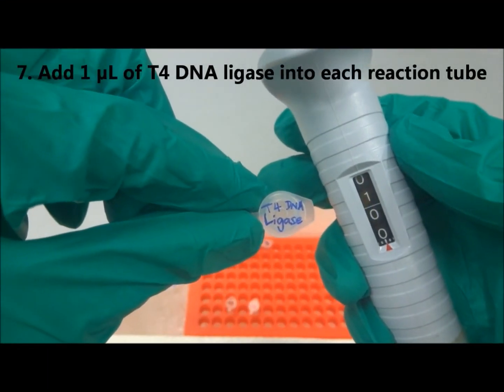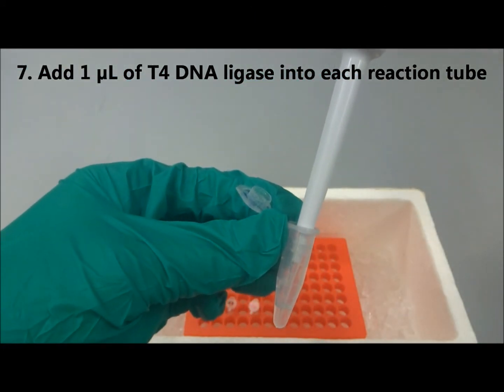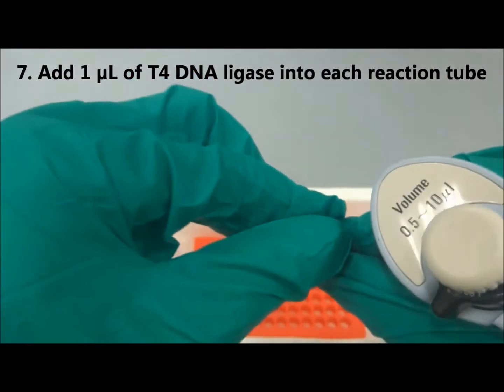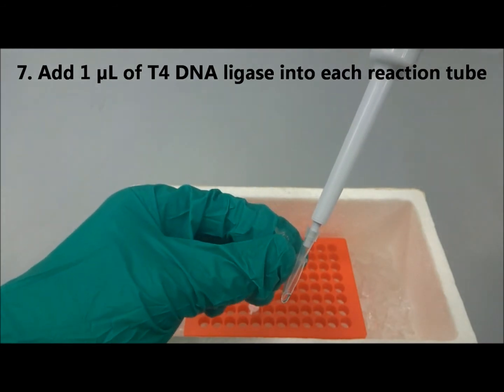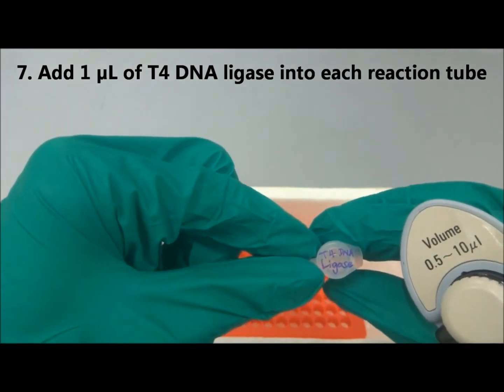Next, add 1 microliter of T4 DNA ligase into each tube. The DNA ligase enzyme should be added last. Remember to use a new pipette tip when you handle different samples.